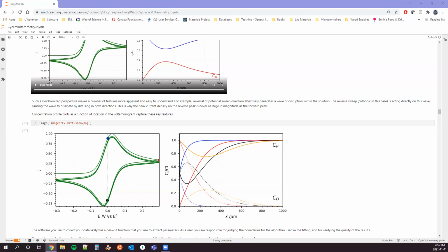Well, I guess we'll see if anyone else has any other questions. Someone's asking if rough surfaces will lead to peak broadening. Not necessarily. You will definitely distort away from the expected behavior, but it depends on how the diffusion layer is growing, and versus your scan rate as well. That diffusion layer is going to grow at some rate. Basically, once it extends far enough away from the surface, it becomes uniform, and so over time it will move towards that limiting behavior. So what do you expect?